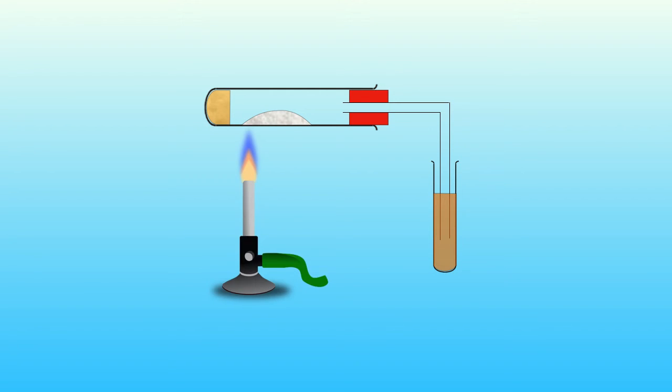Right, now we're going to heat the large test tube, and what will happen initially is you'll see a kind of white vapour appearing, which resolves into little droplets of a runny hydrocarbon. Now, the fact that hydrocarbon is runny tells you it's made of smaller molecules than the one you had to start with. But more interestingly, perhaps, you'll get bubbles appearing. There's a gas produced here as well. And that gas turns the bromine solution colourless, which means the gas is unsaturated. It's probably ethene, could be propene, but it's certainly unsaturated.